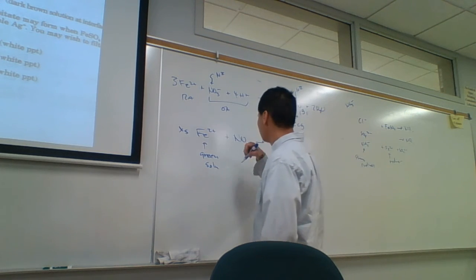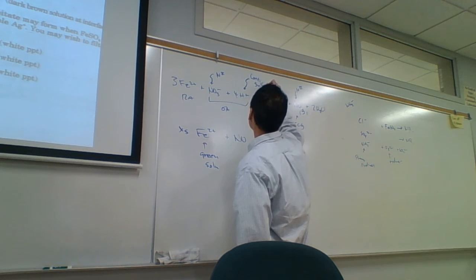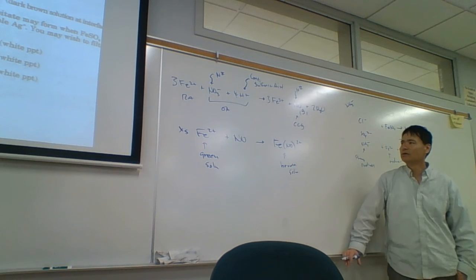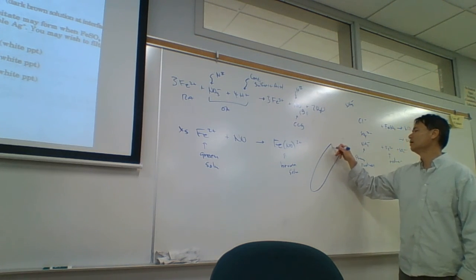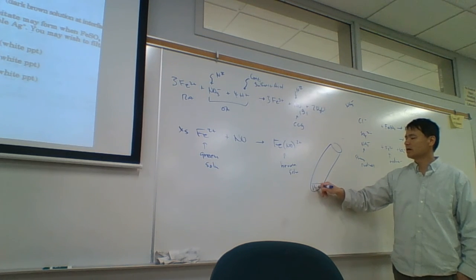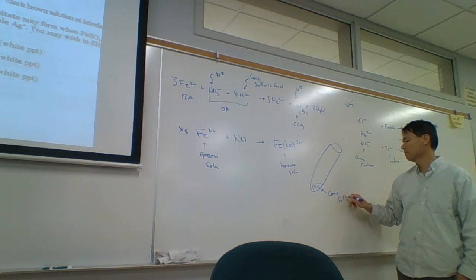Now, this has to be fairly acidic, so what we're going to use is concentrated sulfuric acid. Concentrated sulfuric acid is nasty stuff. We need that for the acid part here. Concentrated sulfuric acid is quite viscous, so this brown solution is going to come here. The concentrated sulfuric acid is like maple syrup. It's going to be stuck down here, and it's CCS. So this is concentrated sulfuric.